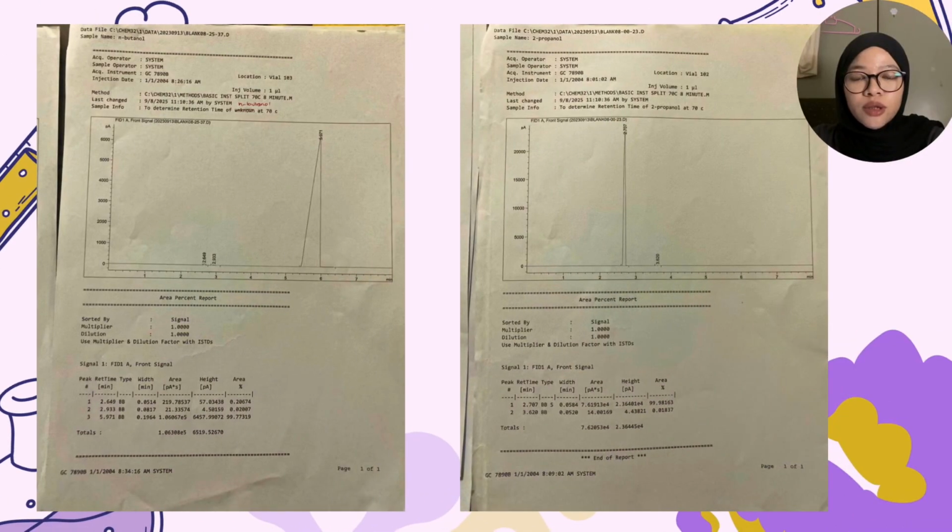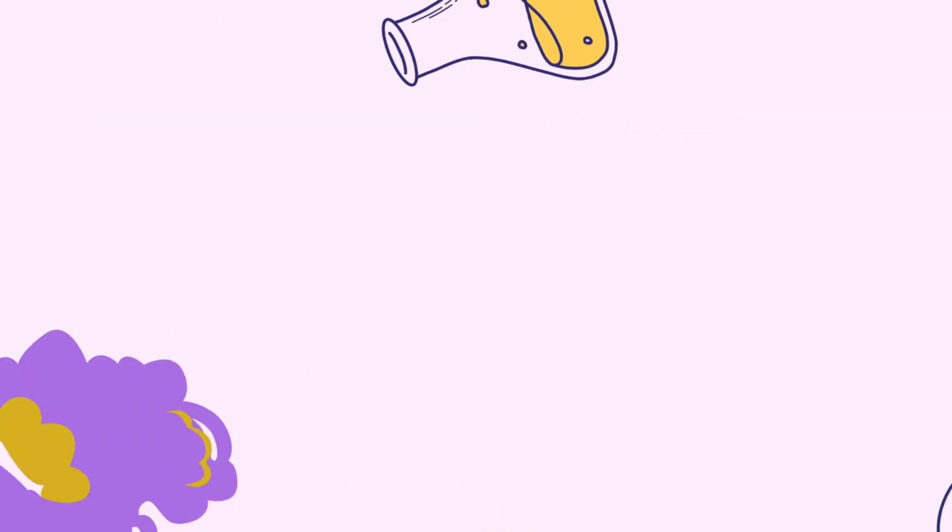These are the gas chromatography results for two alcohol samples. The left chromatogram is for n-butanol and the right chromatogram is for 2-propanol, and also for the standard mixture and unknown. In each graph, the x-axis shows the retention time and the y-axis shows the detector response. Each sharp peak represents a compound detected by the GC. The position of the peak shows when the compound comes out of the column, and the area of the peak shows how much of the compound is present. Since each sample shows one major peak, it indicates that the samples are mostly pure and correctly identified.